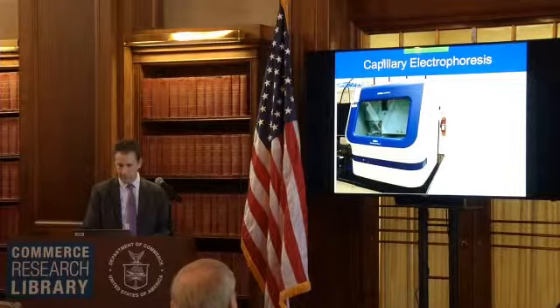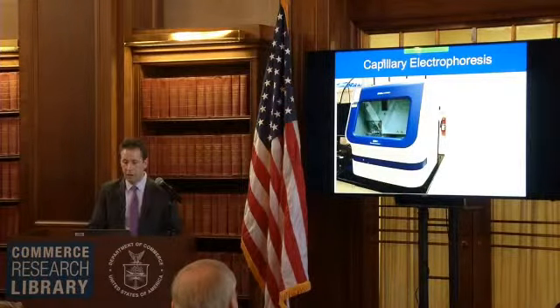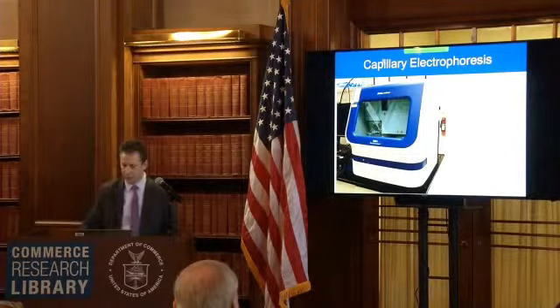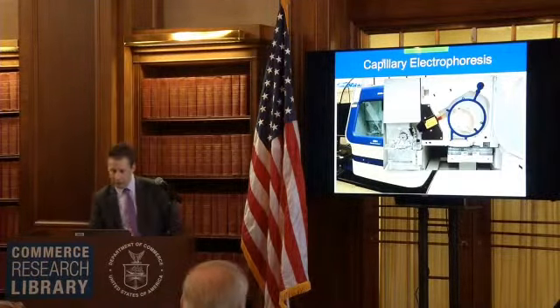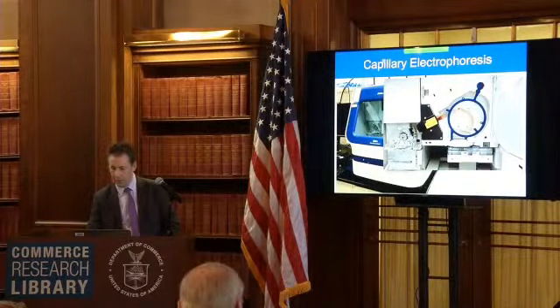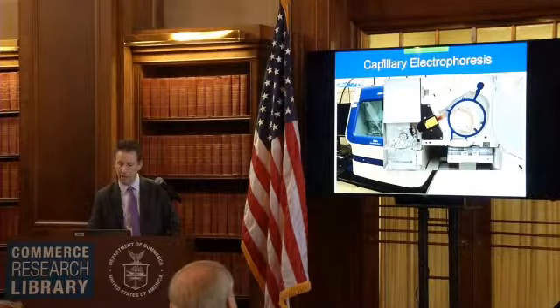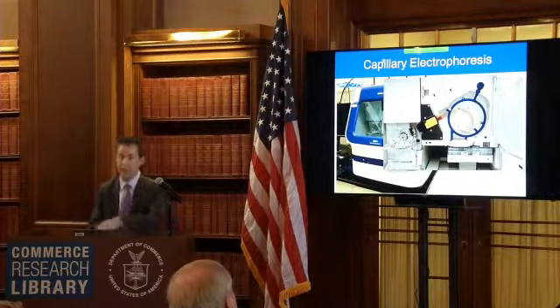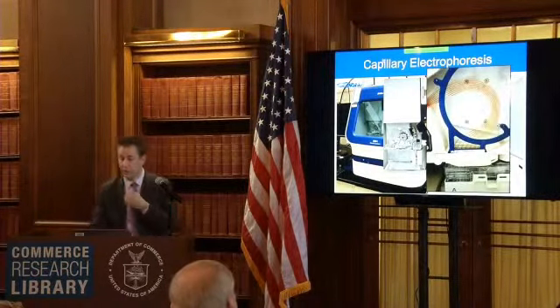This is the capillary electrophoresis instrumentation. It's about as wide as this podium or so, maybe a couple feet tall. And then this is what we're talking about here. This is where the buffer solutions are, and right here is where the laser will strike the capillary. This is a 24 capillary instrument, so your sample tray would be down here around A. You have these 24 capillaries, and that's where the DNA migrates through to be separated and detected.